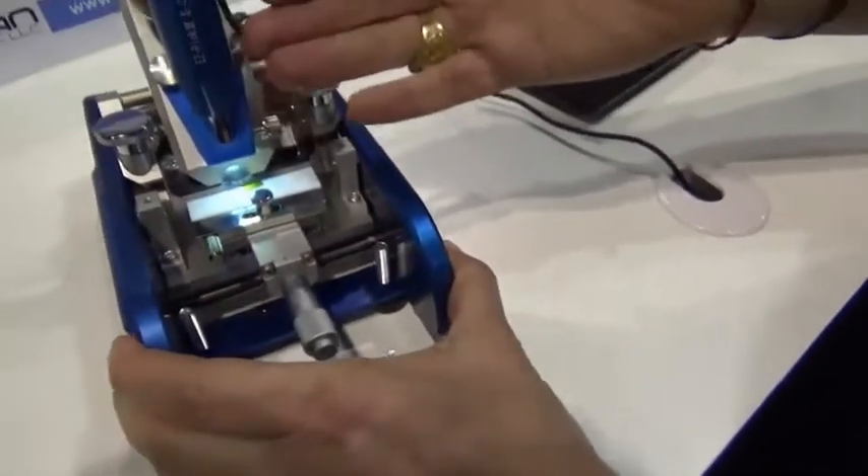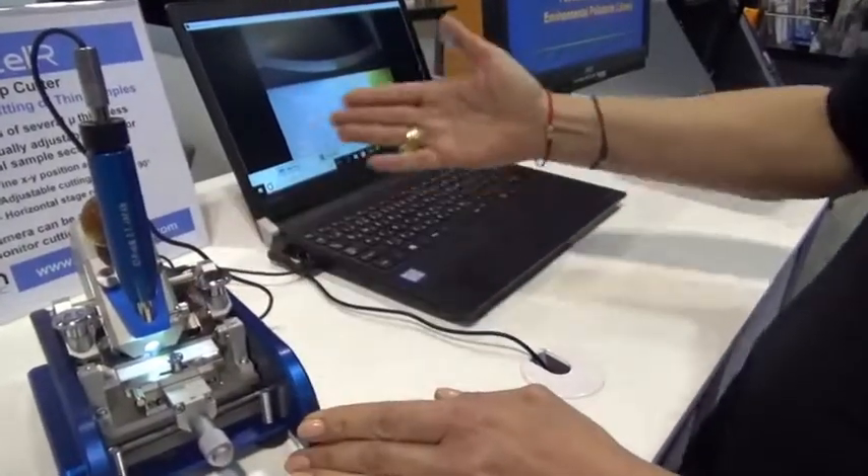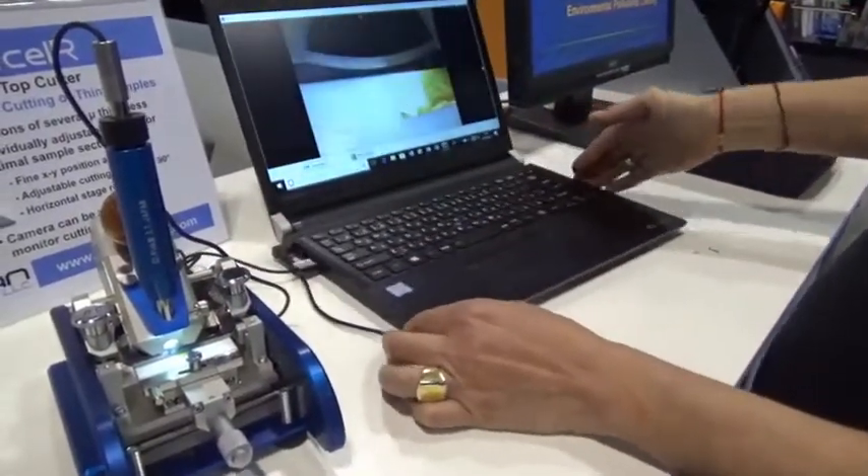Here you see a camera attached to the Easy Slicer and you can monitor all your cutting actions here on your laptop.